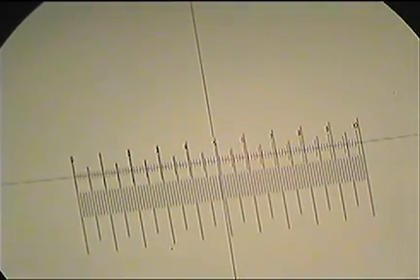So the whole thing is 1 millimeter, and coming back 5 of the smallest units gives 0.95 millimeters.